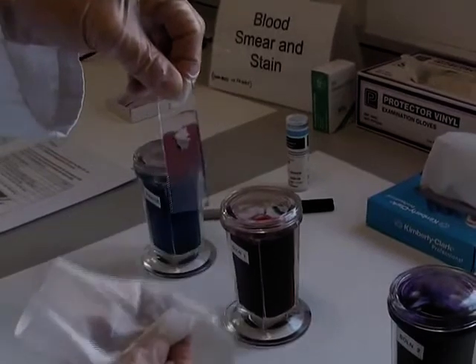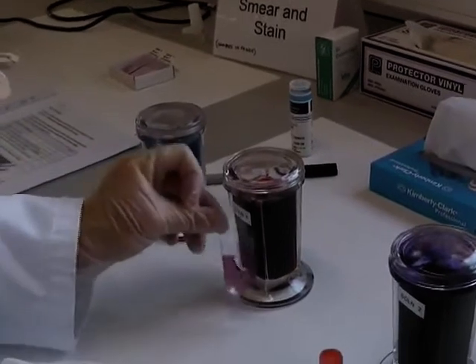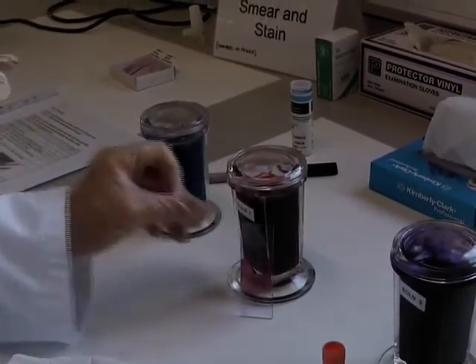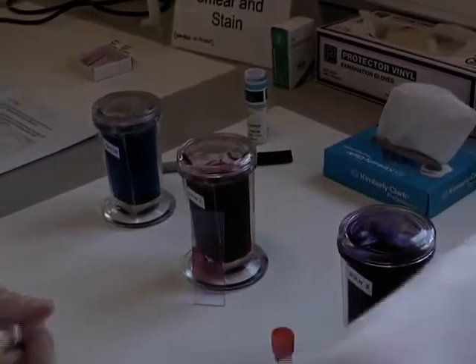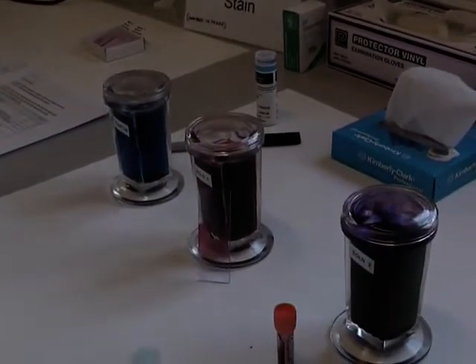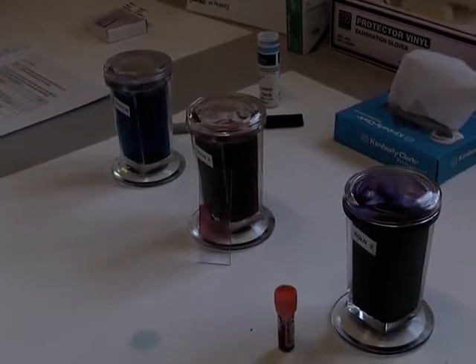Dry the edge and leave it once again to air dry. It's a good idea to dry it upright. Then it's ready to be looked at under the microscope. This method of differential staining is one accepted method — there are others.